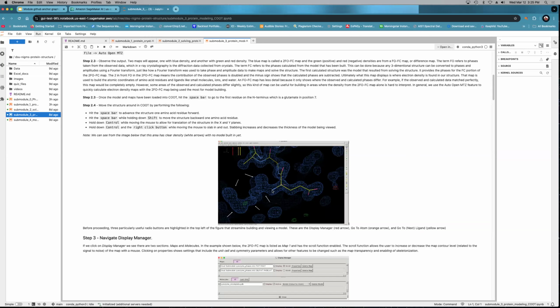And this is, for example, the N-terminal region of this protein. And you can tell based on the electron density where the residues are supposed to go. One of the things that Coot does is you can add a terminal residue, and it'll put in a dummy residue, not really, it's alanine, but that alanine residue will be put into place. And then you look at your protein sequence and say, okay, what is the amino acid residue that has to go here? If it's alanine, fine. If it's one of the others, then you just mutate it to that. But it uses alanine because every amino acid except glycine has a beta carbon on it. And so it more or less should fit.